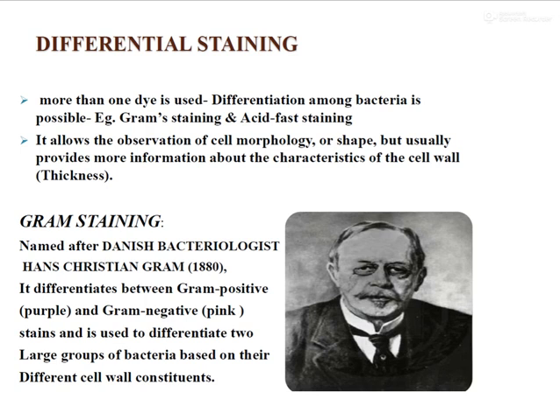During the gram staining procedure, you mainly use two different stains. One is crystal violet and one is safranin. All those bacteria which appear purple in color, or which take up crystal violet, are considered gram positive, and all those microorganisms which take up the second stain, safranin, which is pink in color, are considered gram negative in nature. So if you consider the whole pool of microorganisms, some of them take up safranin, they are gram negative, and some of them take crystal violet.